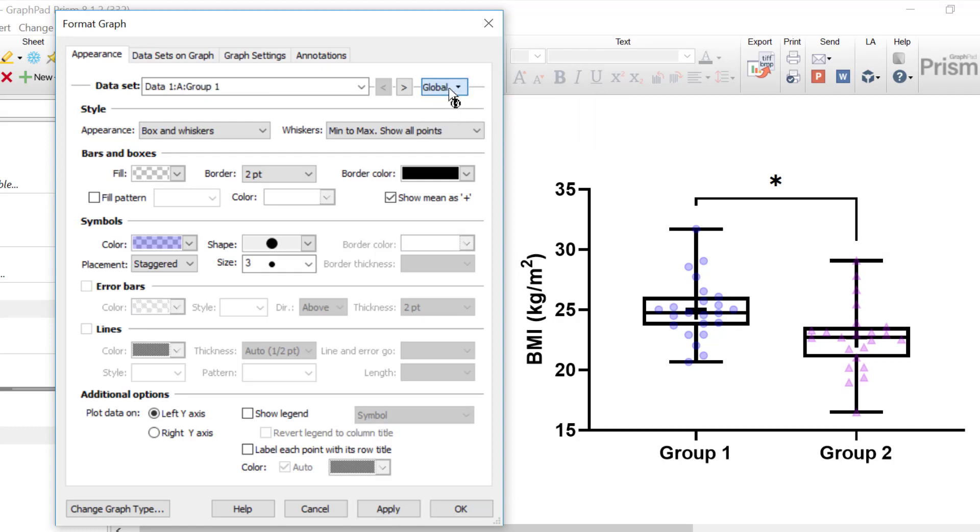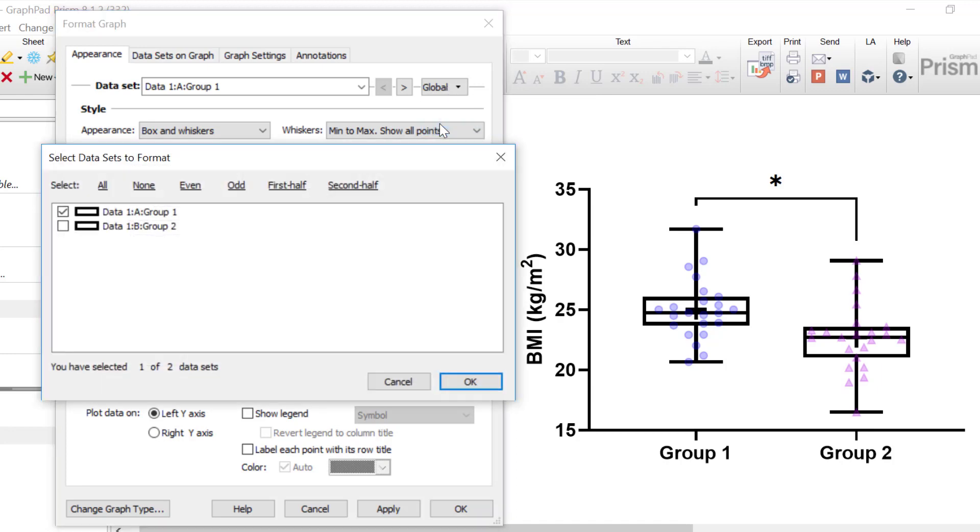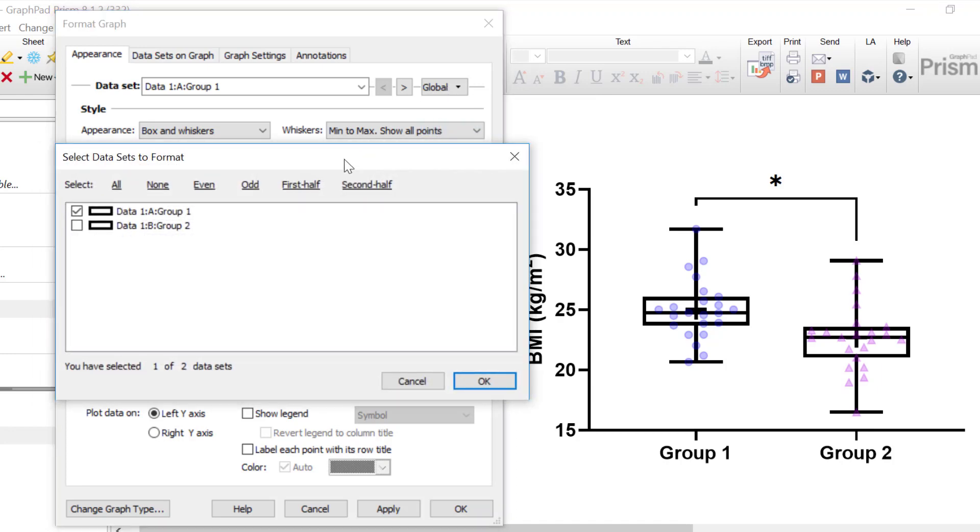Alternatively, you can use the top right drop down menu again and select Select Datasets. Within the new window, you can use the All button to select all of the data sets on the graph and then click the OK button.